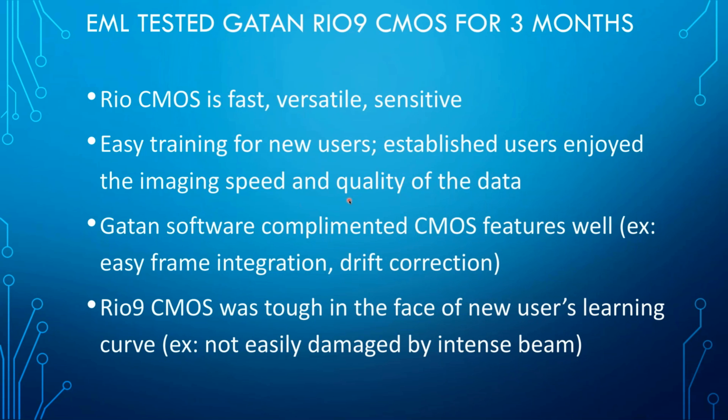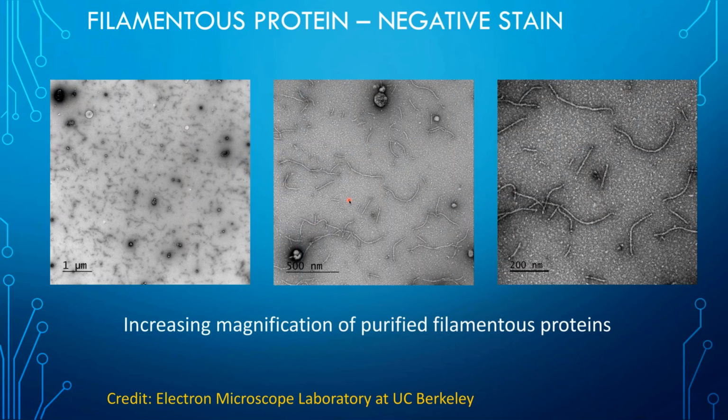Okay. So let's jump into some data. I thought I'd start with some purified protein that a user had brought in to image, and we thought, okay, why don't we try this with the Rio? And we had both our CCD and our Rio mounted on the Tecnai 12 at the same time.